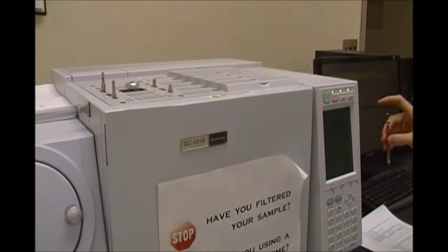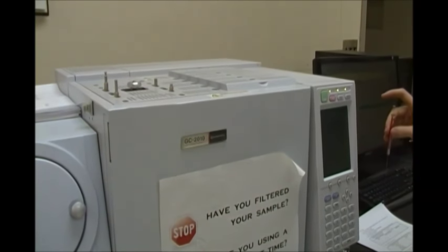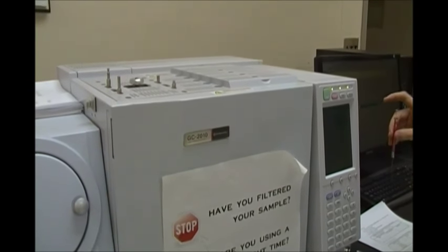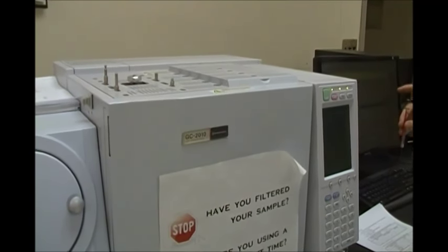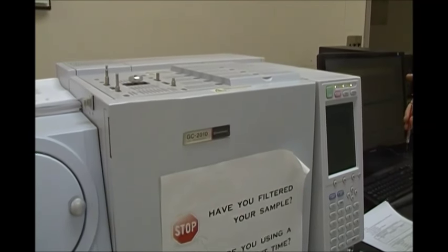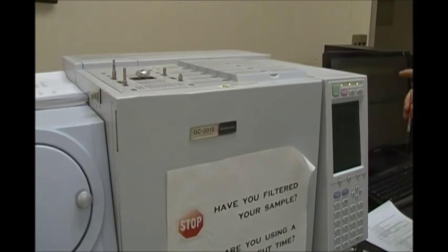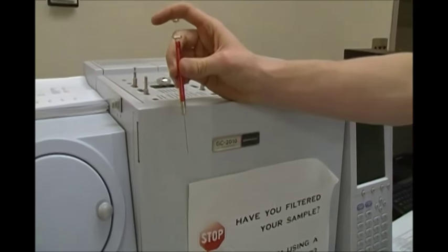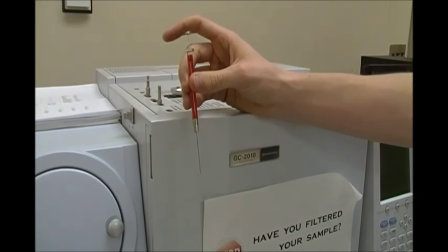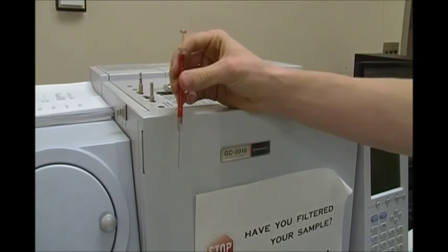Alright, so we've already clicked OK and we've clicked on standby. Basically our GC is set up, all the temperatures wherever we want them to be. So what we're going to do now is inject our sample. Our sample is going to be 1 microliter with no air buffer right here in the syringe.